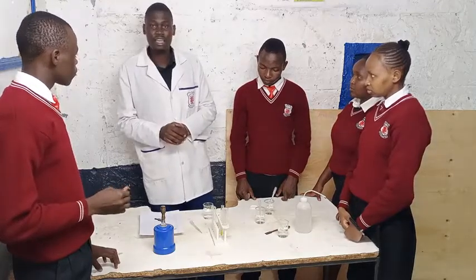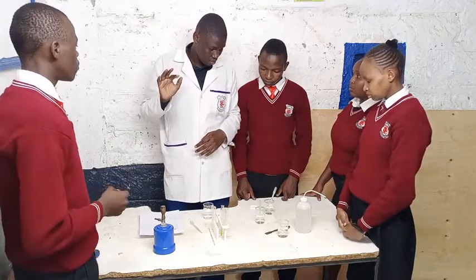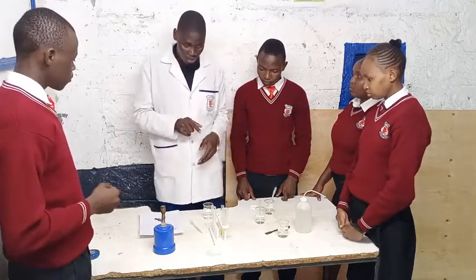I think that's the end of the lesson. At the end of the lesson, it's always good to clean everything. So I will require you to clean this.